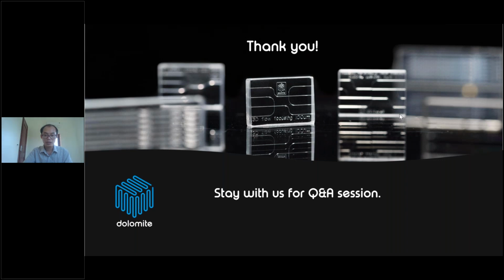Okay, another question from Balasubramanian, sorry, I cannot say it. So, how do you control the size and molecular weight of PLGA simultaneously? Oh, yeah, this one is a question from the topic that we ran in the last webinar.